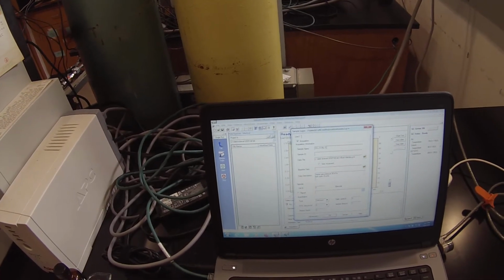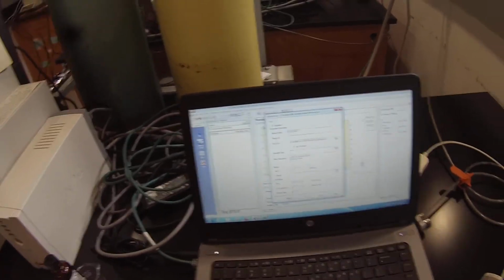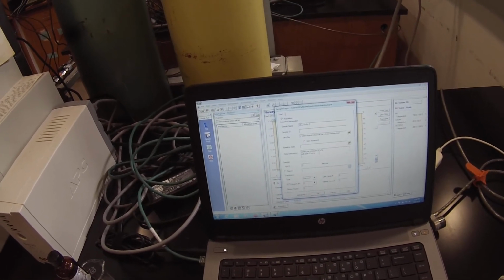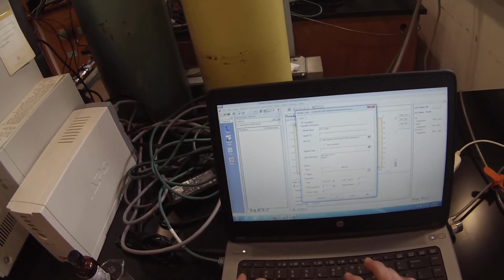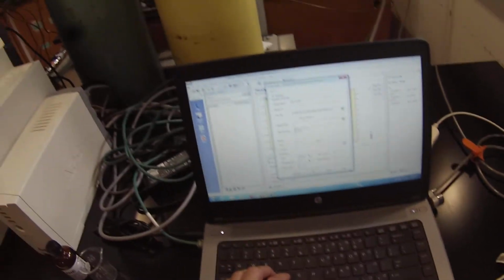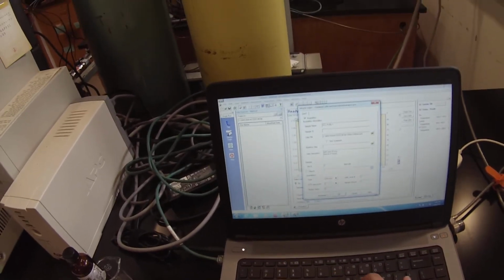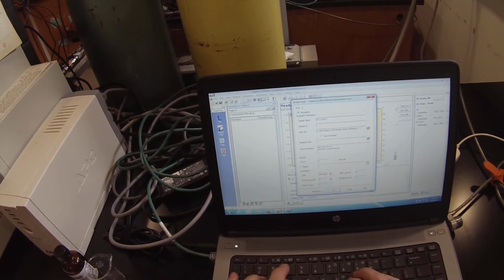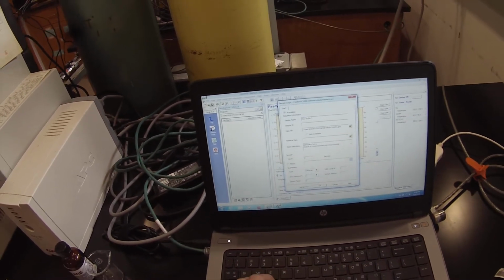So the sample name, that's where you put your lot number, or your spectrum number rather. Sample ID we usually leave blank. Data file can be anything you want. And then under the data description, carrier gas pressure, 90 kilopascals, split open 6 turns. And I'm going to add to that mixture of n-butyl bromide, and n-butyl chloride. And OK that.